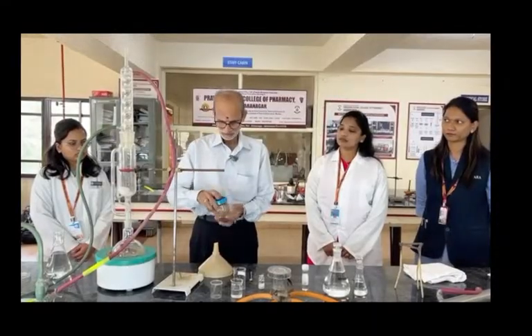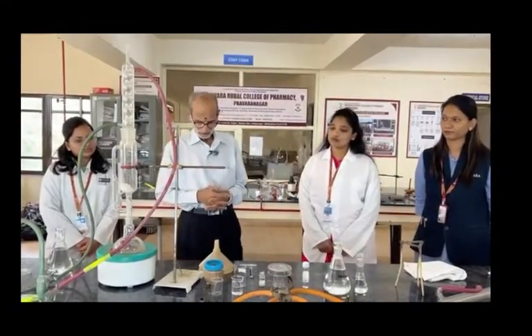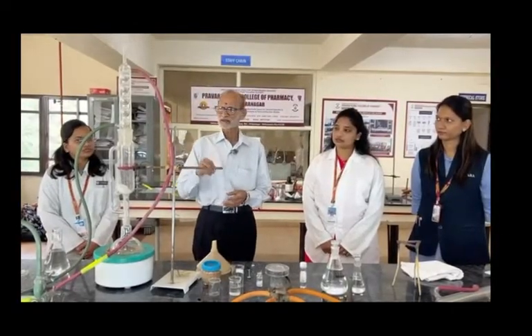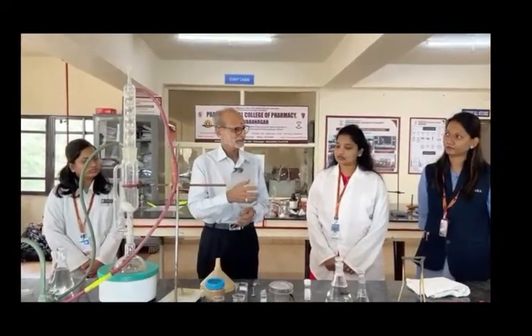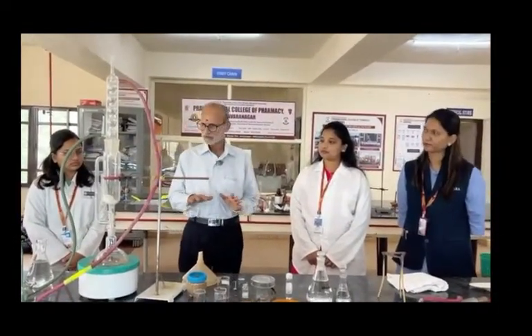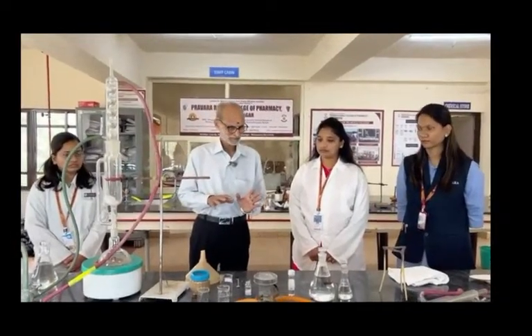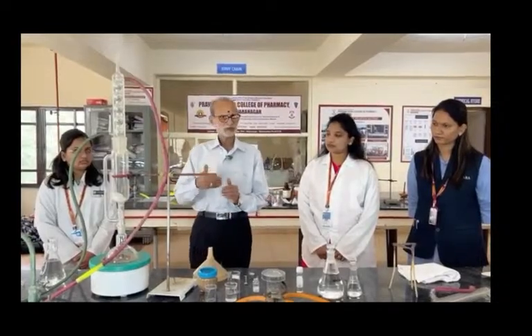Embelia ribes is normally used in the traditional system, or folklore. Normally when water is given to an infant, there is a practice that we add 4 to 5 fruits in the water, boil it, and that water is then fed to the infant. It's a practice. Embelia ribes is known in the vernacular as vidang or vaividang. Now, in this demonstration, we are going to do the extraction and isolation of embellin from the fruit.